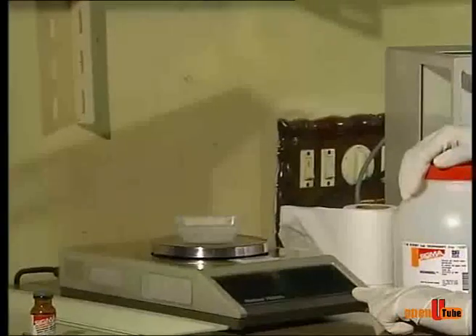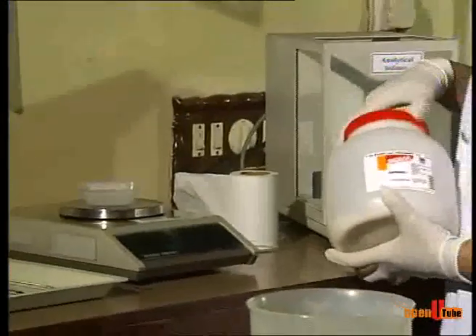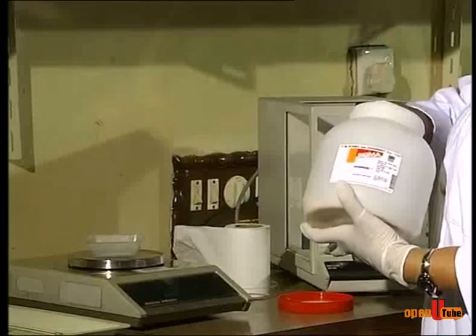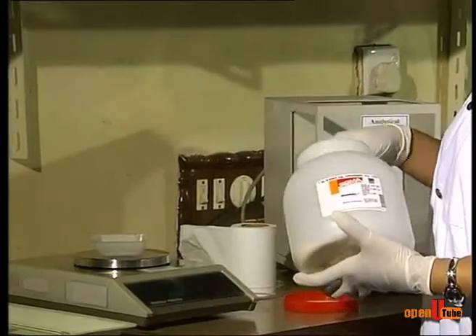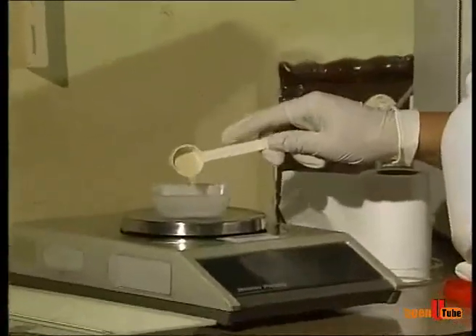Agar is the solidifying agent. Therefore, it is required to add agar to solidify the MS medium. With the help of an electronic balance, measure the required amount of agar and add into the MS solution.